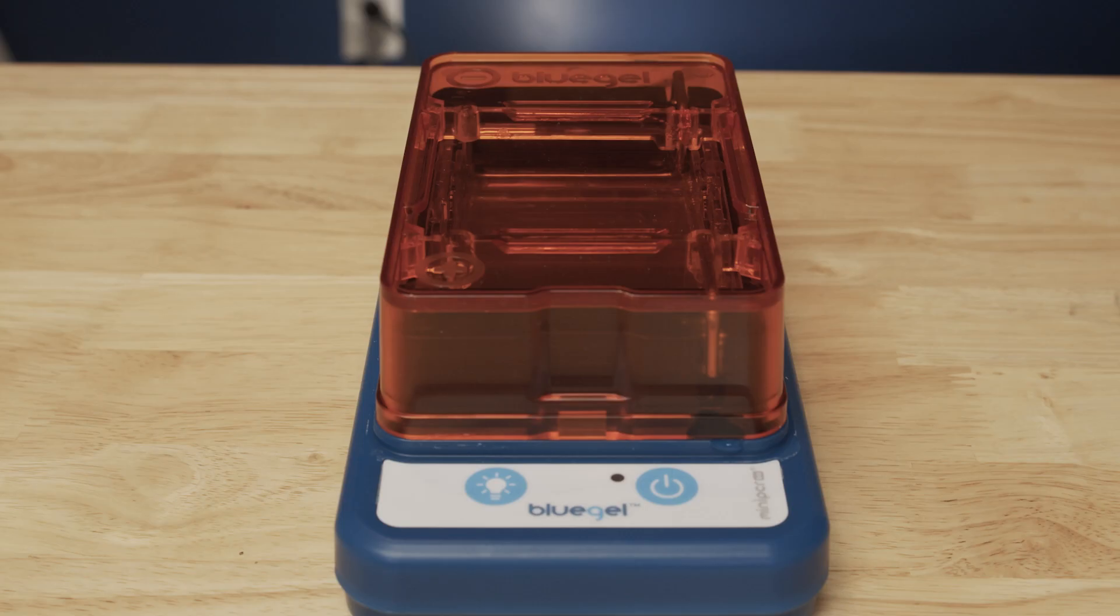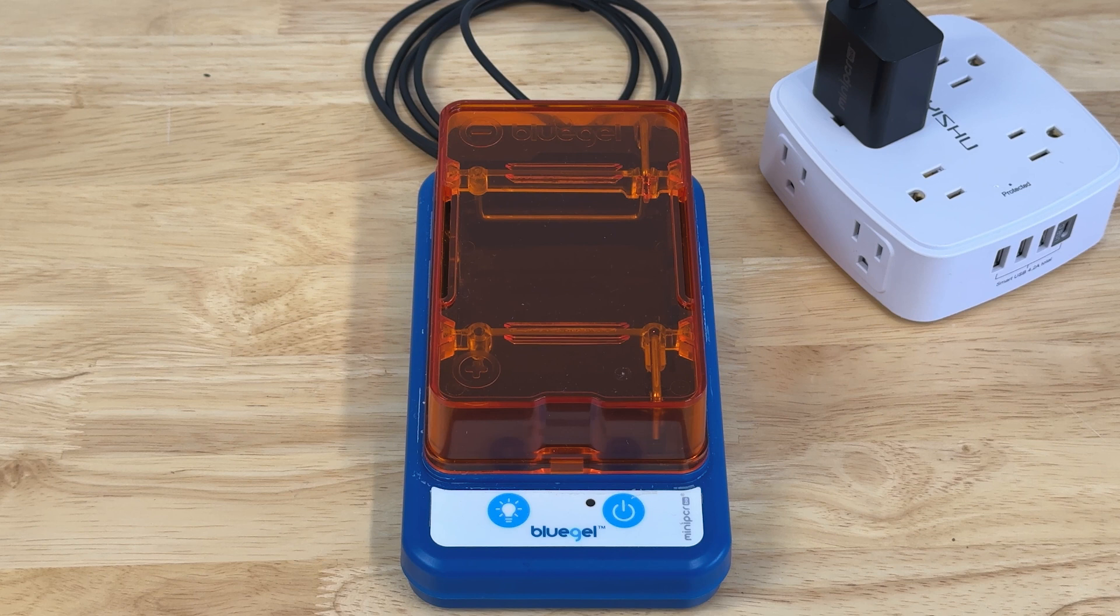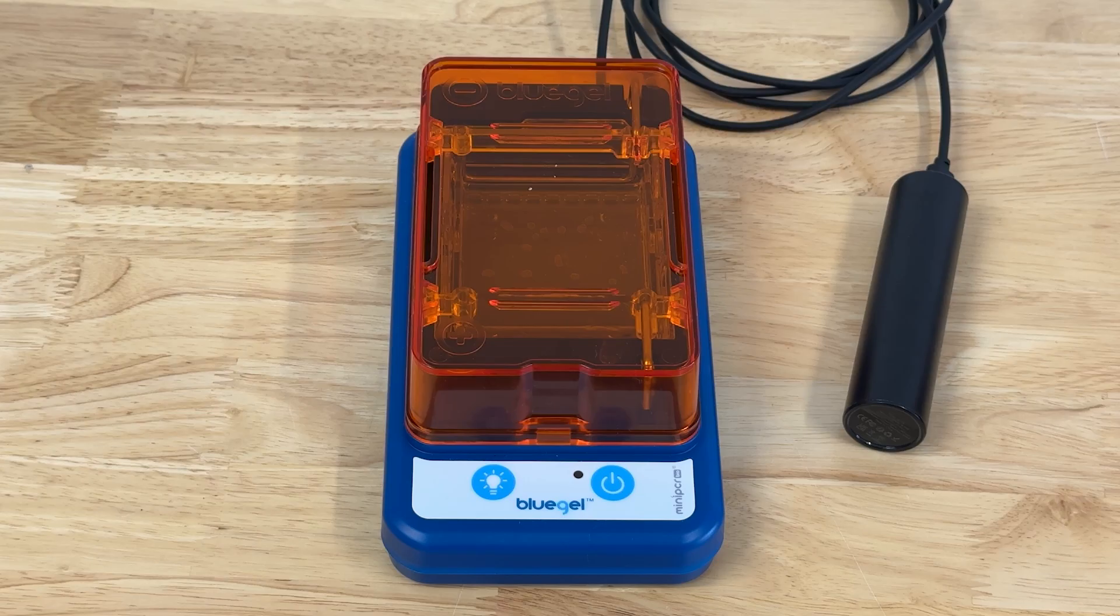You can begin to visualize the DNA samples as soon as the Blue Gel begins to run by turning the blue light in the base on with the small light bulb button. You can turn the lights in your room off to make visualization easier.